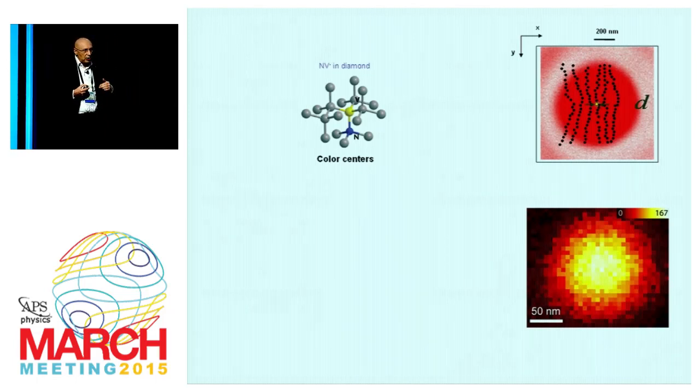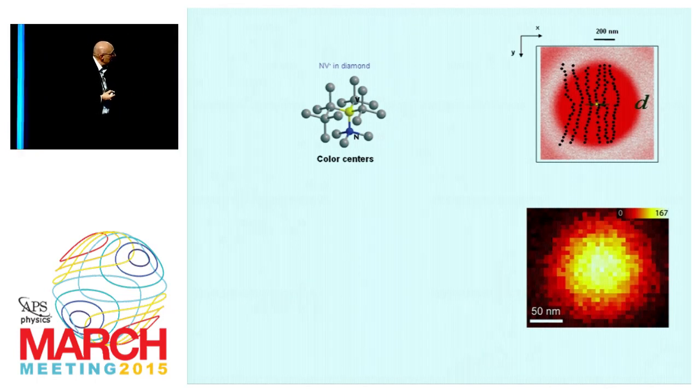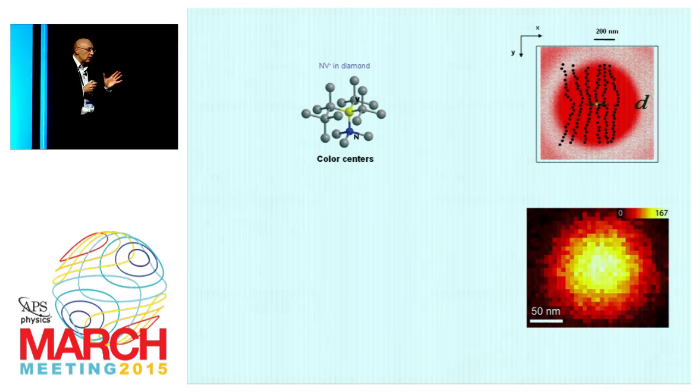And so one has to refine, of course, the molecular states and so on to get to a higher spatial resolution. And with organic molecules, that may work in the end, but right now, the resolution is, as I said, of the order of 20 nanometers.